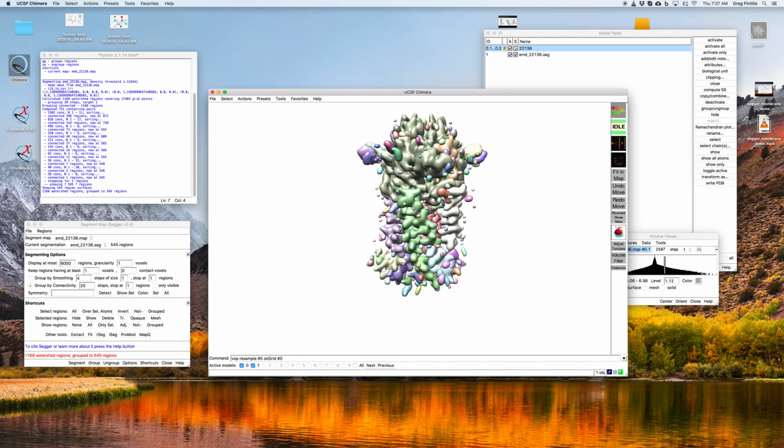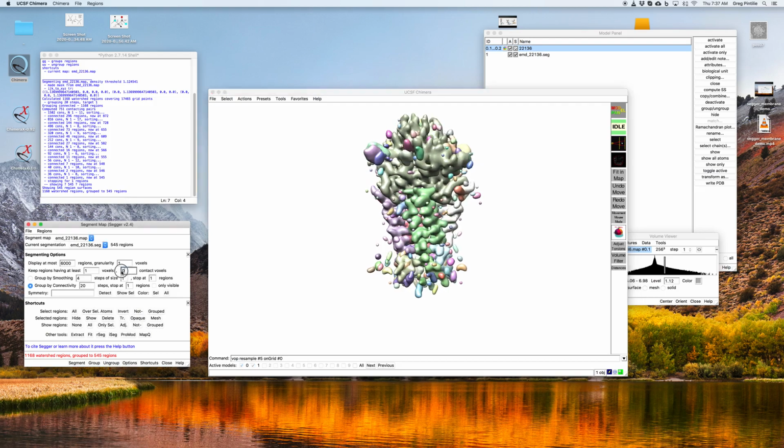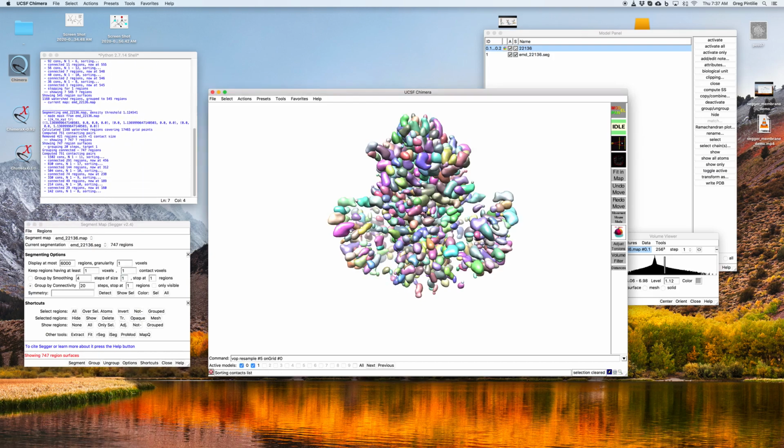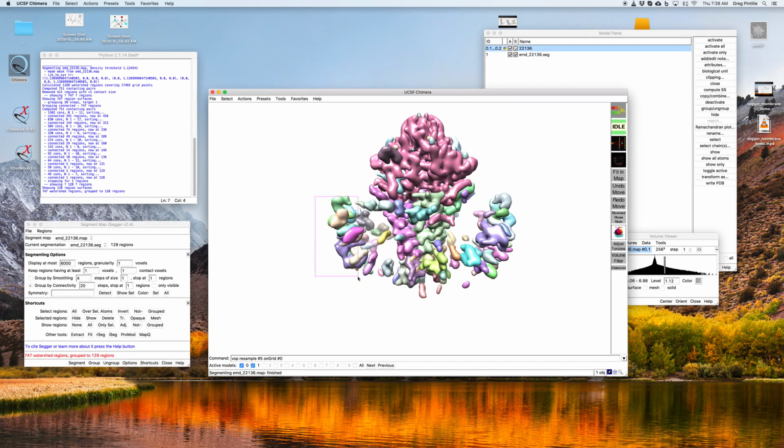Now that I've selected these, another option I could try to use here is to get rid of segments that don't have any contact. What this will do is remove some of those small regions that I saw there that were really just on their own. So yeah, this might be a little bit cleaner if I do it this way.